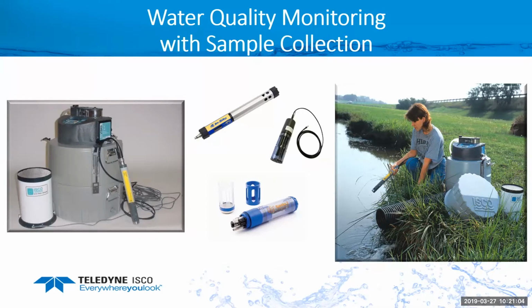And so here, this is multiple measurements. Also you can see there's a 700 module on the side of the 6712. Looks like that's a bubbler. So they're going to have a level measurement, a rain gauge, and a sonde parameter to be able to take those samples all based on those conditions.